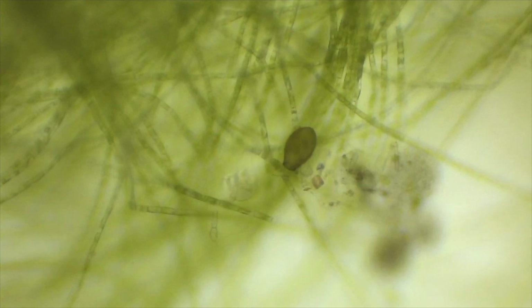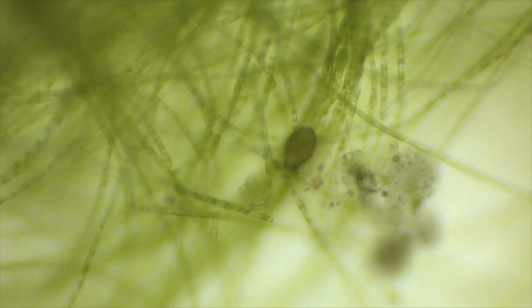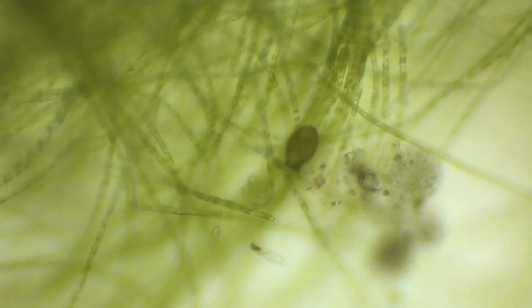Here is the unknown organism from video 1. Note the rigid appearance of its cell body and rapid moving cilia at its base. Now here is the hypotrich ciliate from the newly observed drops. I was able to observe this specimen more clearly than the last due to the lack of algae and the flatter landscape provided by the cover slip.